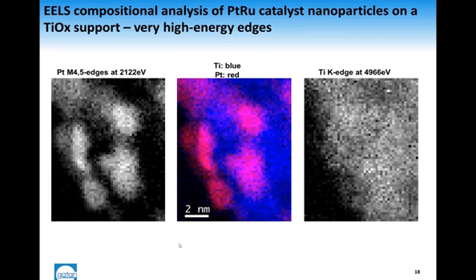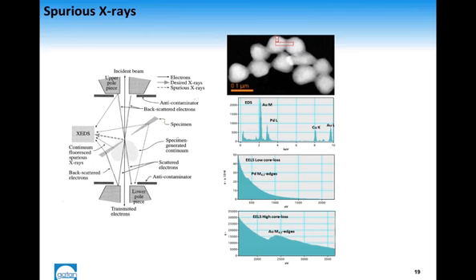So again, this is to prove that now we can do EELS from high energy edges from heavy metals, and there's no need of using EDS only for these high energy edges of heavy elements. EELS is pretty suitable for characterizing these materials.